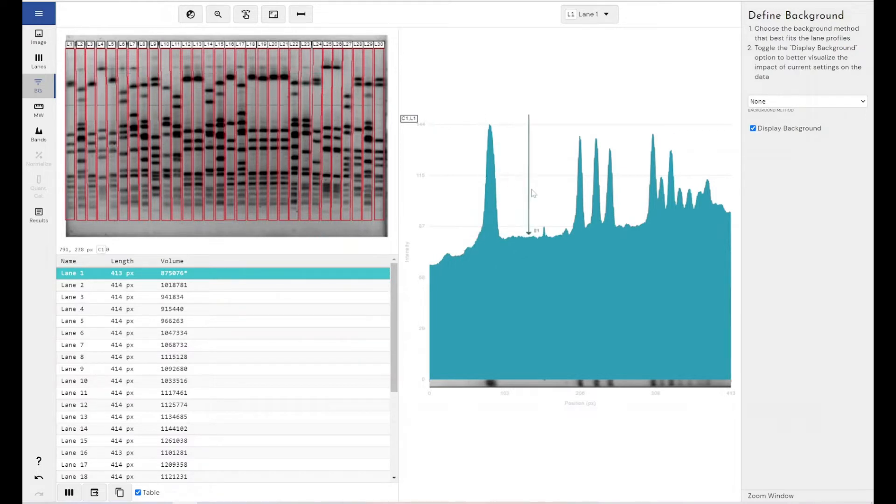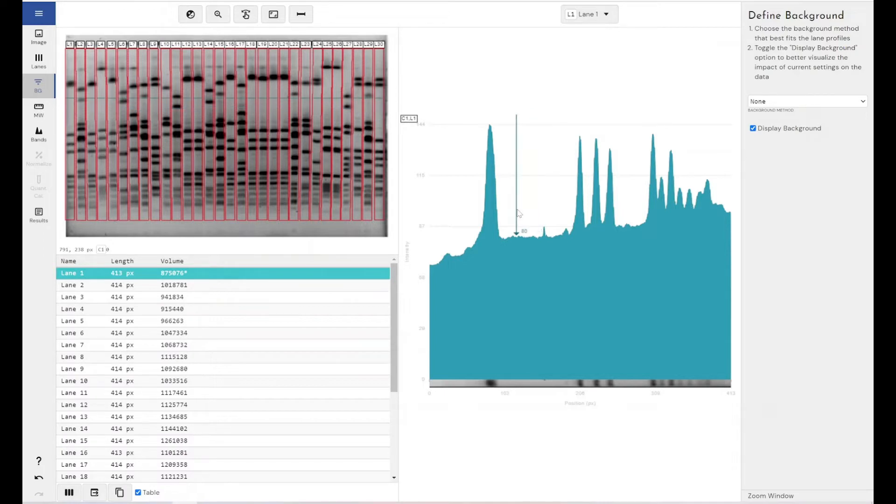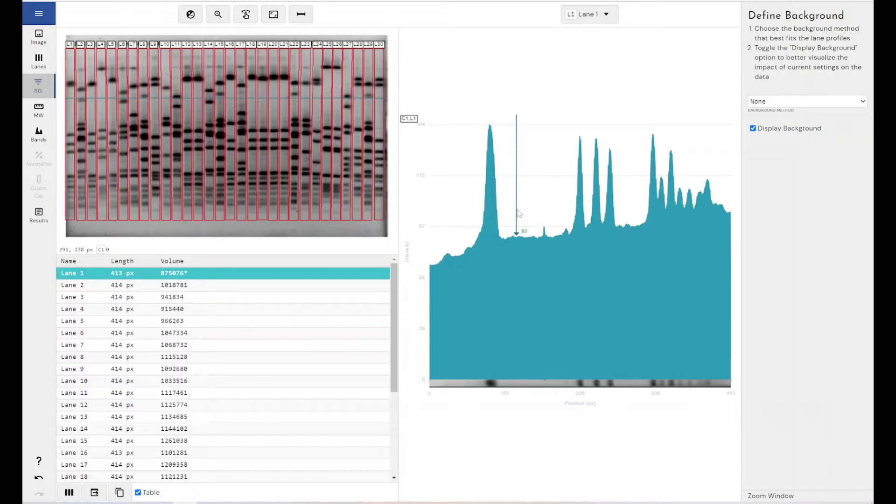Now, an issue with applying background removal at the same value across the length of our lane is you can see the background level changes along the length of our lane. This is very common. It's very unusual to have an image where all background is the same value and you can just subtract it.